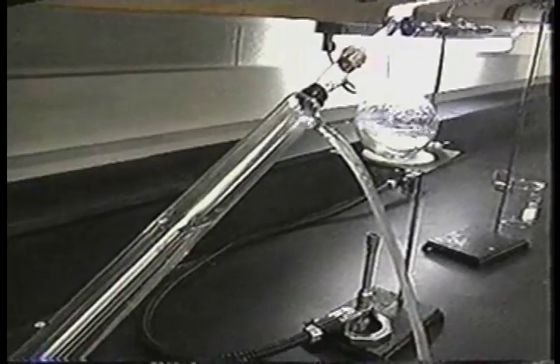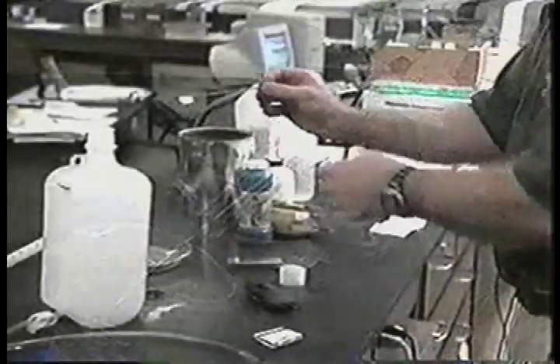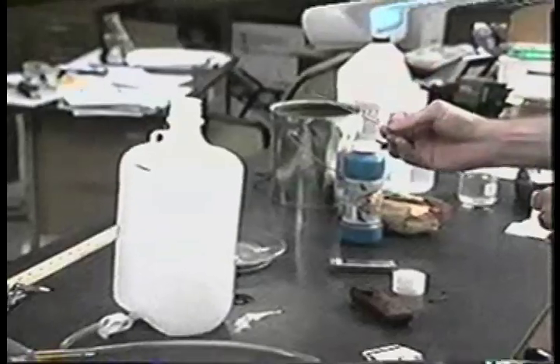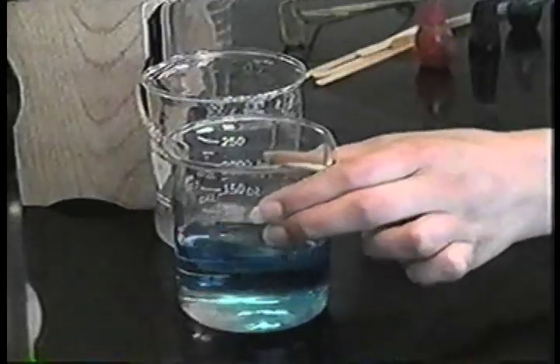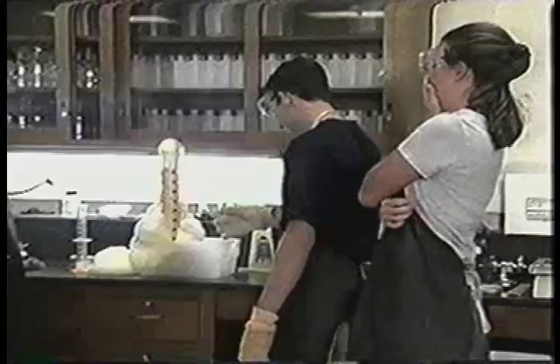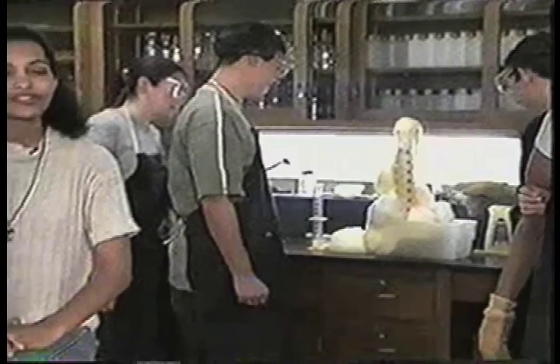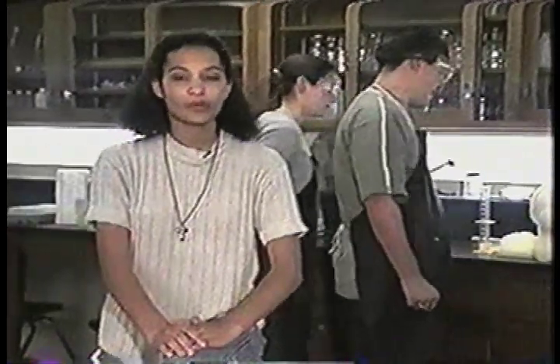Scientists have discovered causes for some diseases and developed medical treatments in laboratories. Things we use every day, plastics for instance, got their start in a laboratory. And scientists continue to work on developing life-changing, sometimes life-saving materials right here in a laboratory. Students wear goggles. This is really an exciting place, but, and this is important, you must follow certain safety rules to keep the lab safe for you and for everyone else who's going to be working with you.